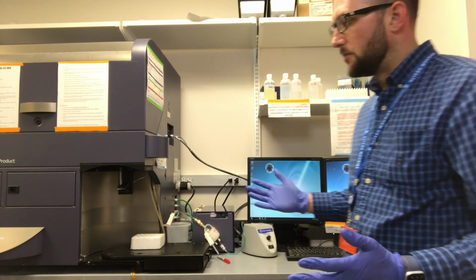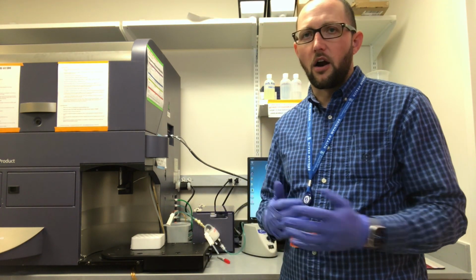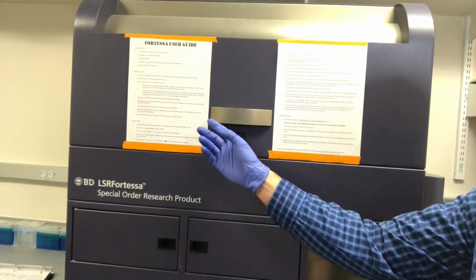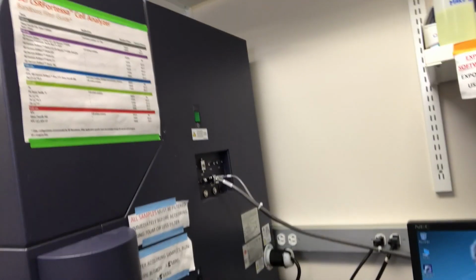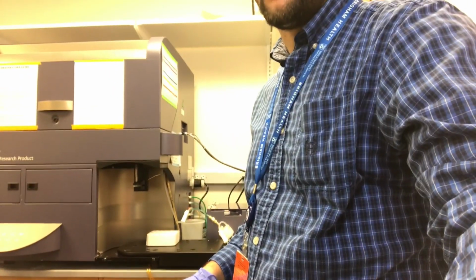As we assess the machine, we see that it's comprised of similar parts to our Canto 2, where we have a wet cart, a computer, and a cytometer. The cytometer itself has a user guide, which we will cover in this orientation, but is always here for your reference to follow along. And a configuration here on the side, which shows the 5 different lasers. The 2 that are not on the Canto 2 are the UV laser and the yellow-green laser.